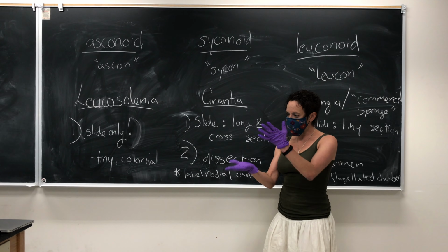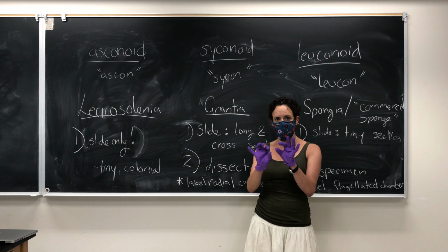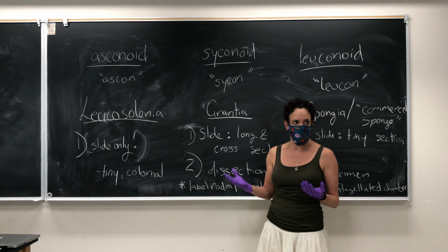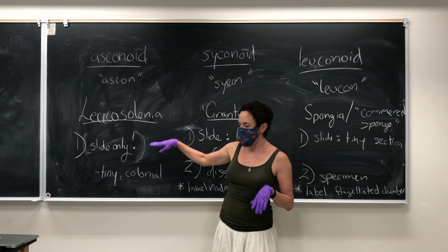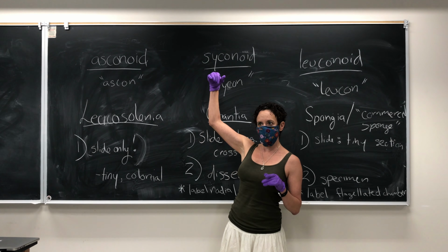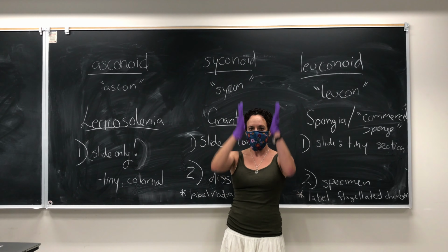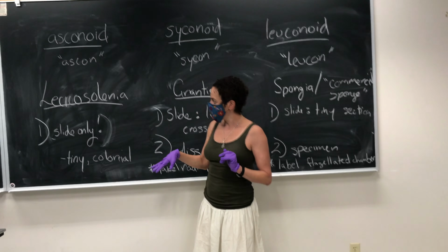These guys are really tiny and fragile and colonial, so you actually have multiple bodies on one slide, and many of them get mushed. So just try and find the nicest one. We took a picture of a pretty nice one. On that one, you're just supposed to label where the water is getting pulled in, which is through the sides, and pushed out through the top. Again, it's a super simple body plan.